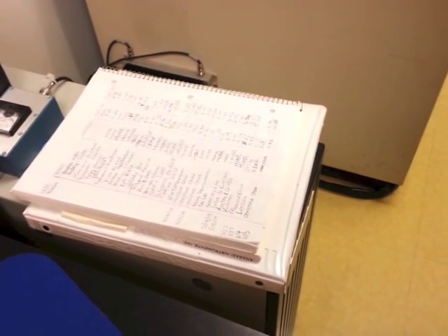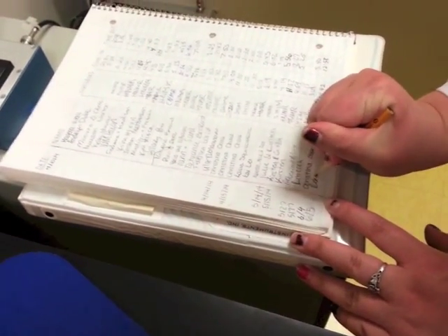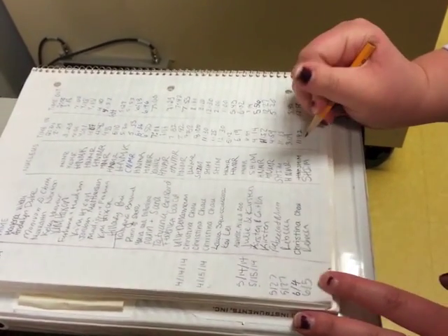Before you start using the NMR for the day, you want to sign in. First write the date, your name, and instead of the nucleus, you're going to write SHIM, and then the time.